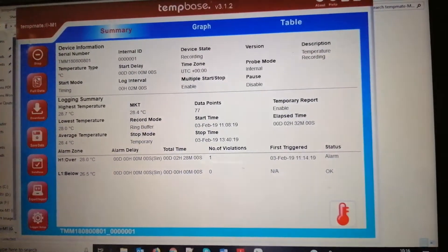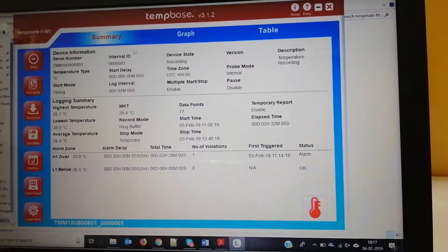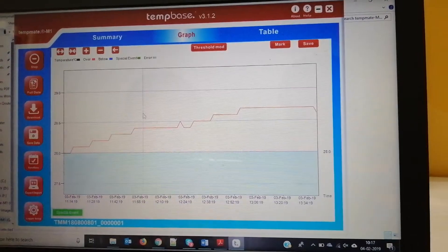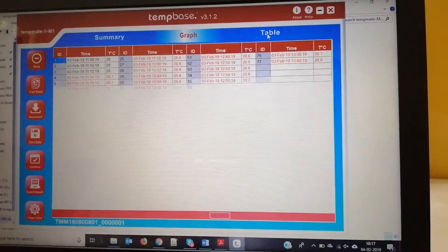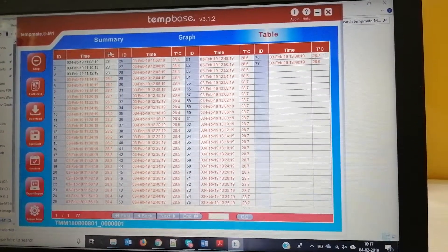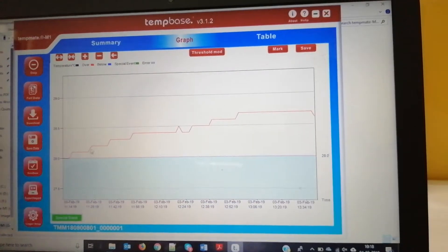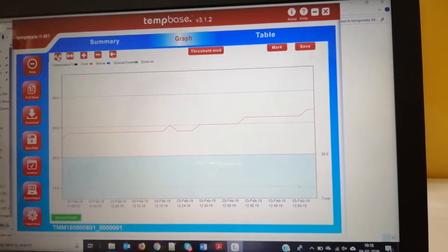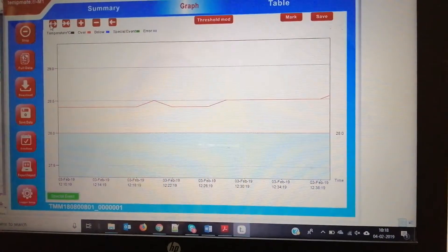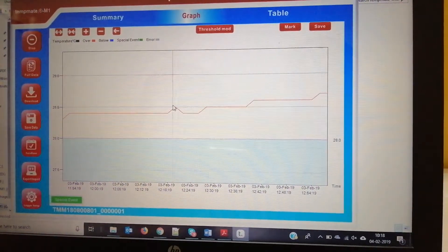These are the software configurations of this data logger. As explained previously, you can see the data here in graphical form — this is the graphical form — and in tabular form, with timings, temperature, ID, and all other fields. In the graphical form you can zoom in and zoom out to view particular temperature ranges in detail.